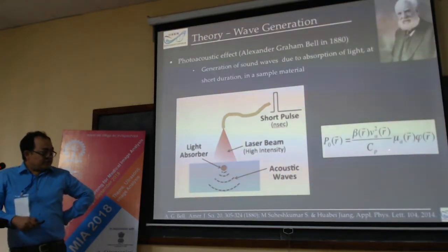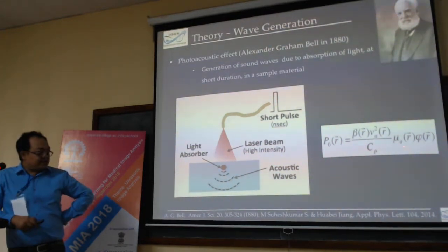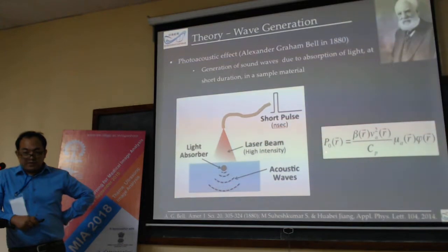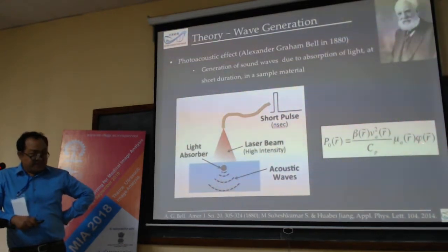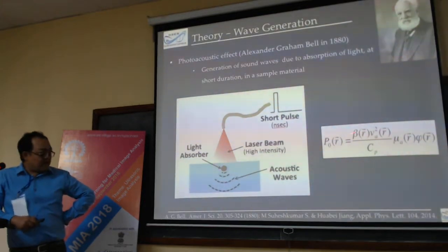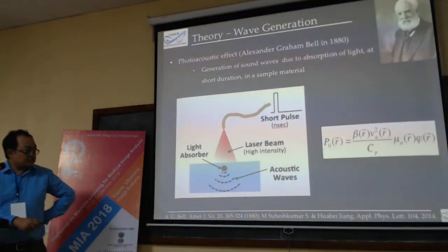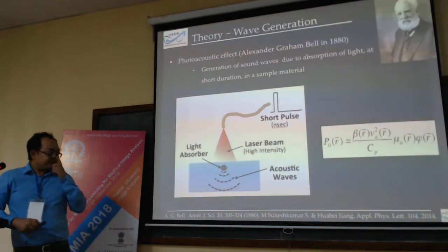So, based on this knowledge, people started exploiting the extraction of the absorption coefficient from this, because among these parameters, with a given optical energy, the main parameter that contributes to the photoacoustic signal is mu a. The other parameters contribute less. It is not so easy, because the signal strength is very low.